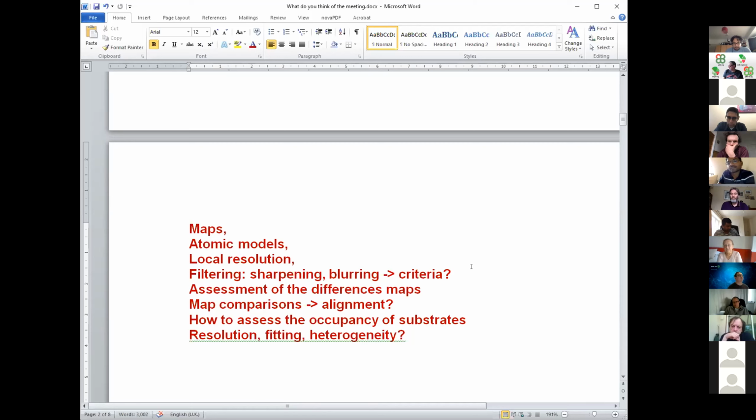But I don't know. Possibly when somebody was doing validation in the EM database, it was done in an automated way. They didn't realize and they didn't fix that. The question is whether we could add something in EMDA that PDB or EMDB can use just to say whether the origin is correct or not.